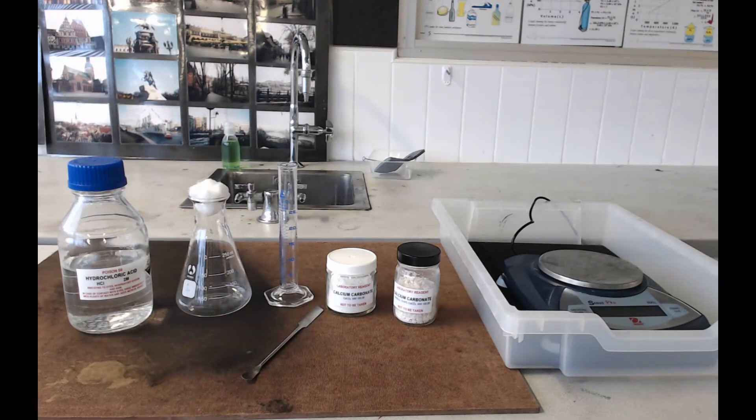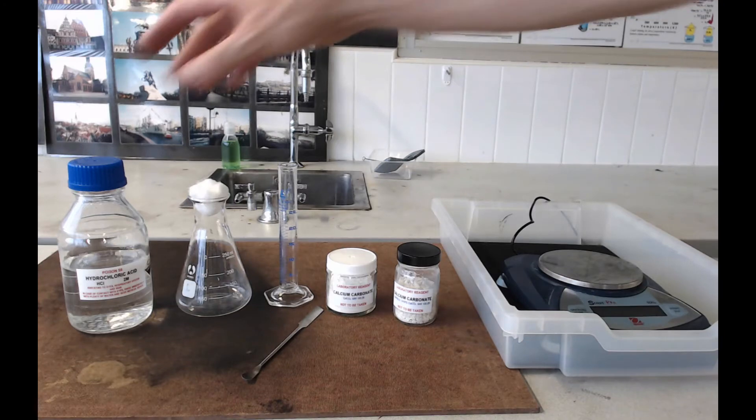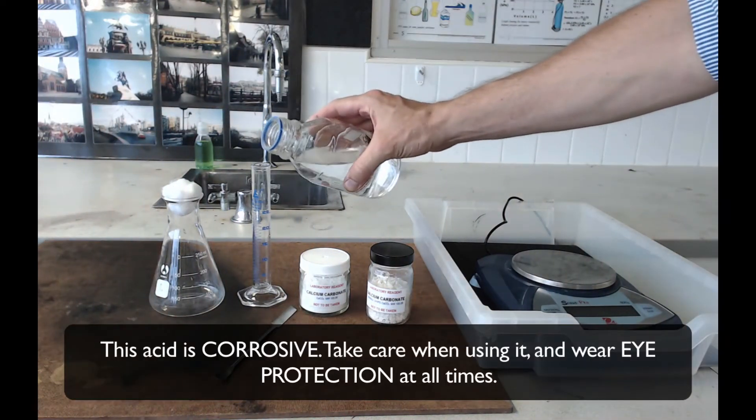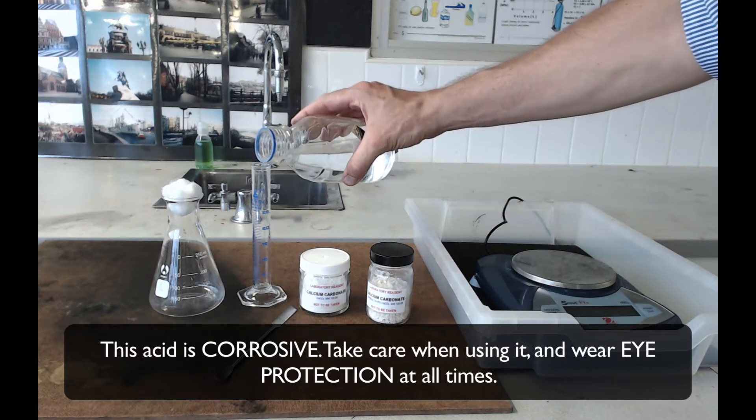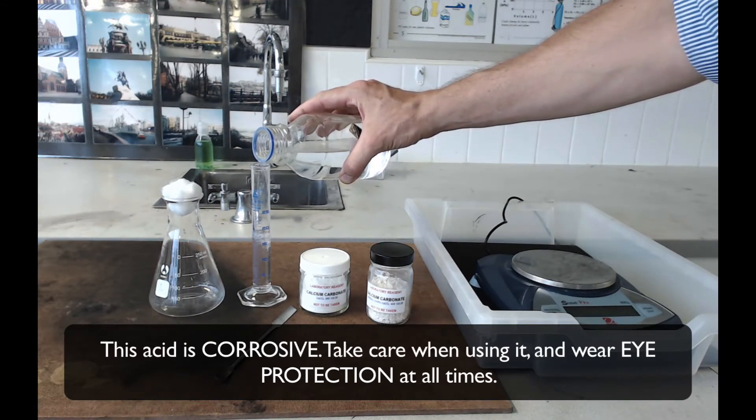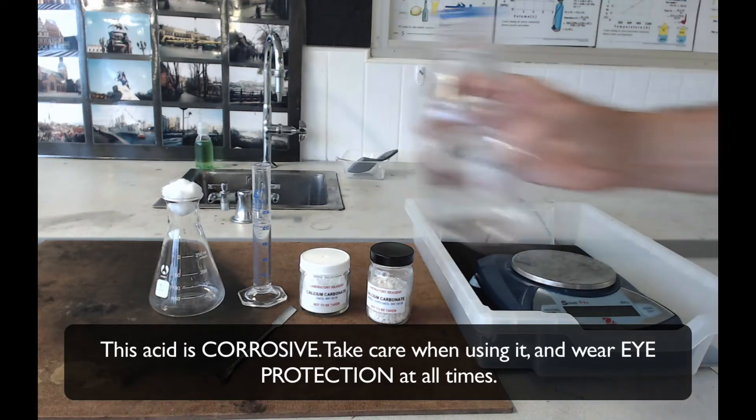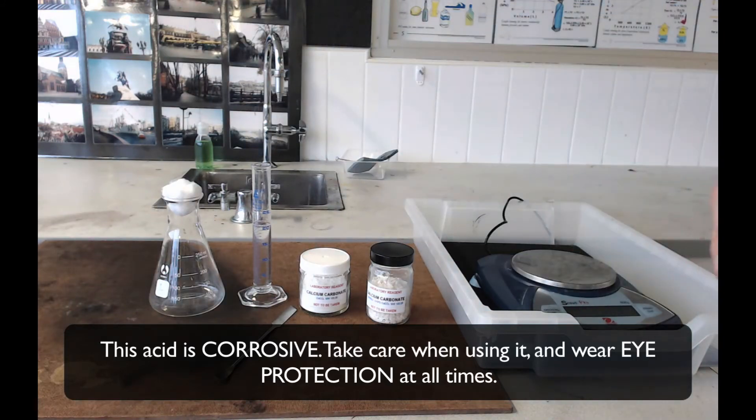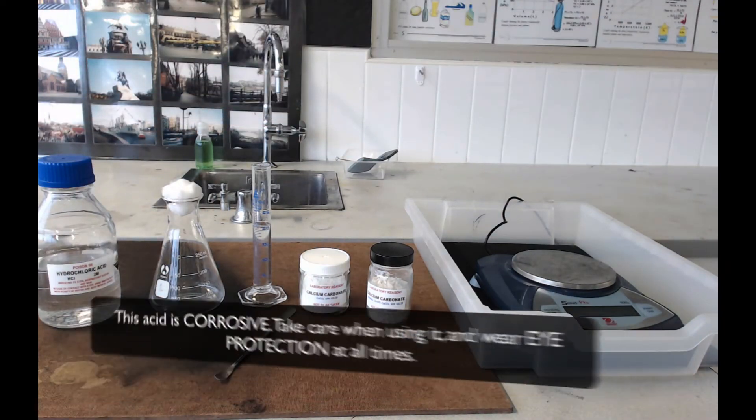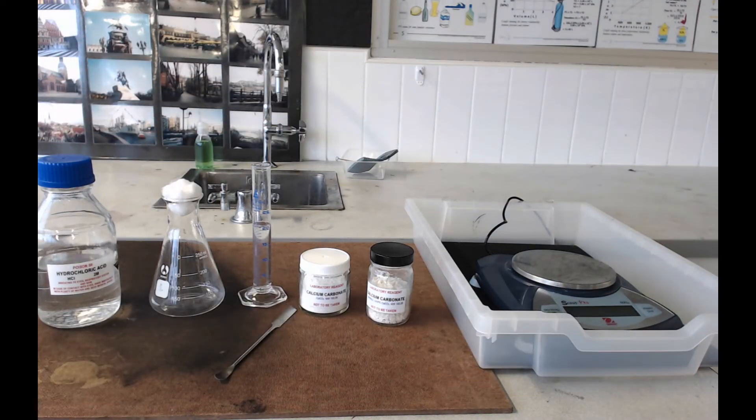Now the first thing to do is measure out 20ml of hydrochloric acid. Just pour as close as you can to 20ml into your measuring cylinder. If you take a little bit too much, just pour the excess down the sink - don't put it back in the bottle because that could contaminate what's in there.